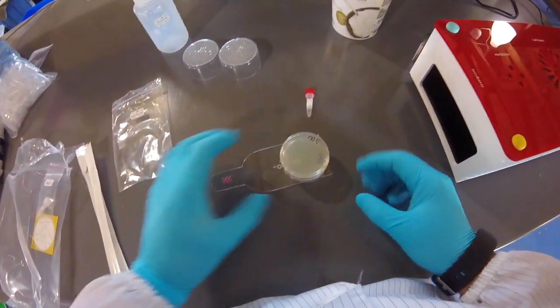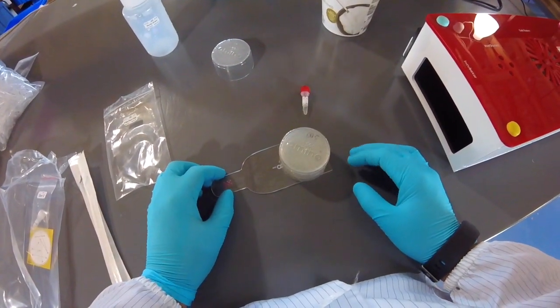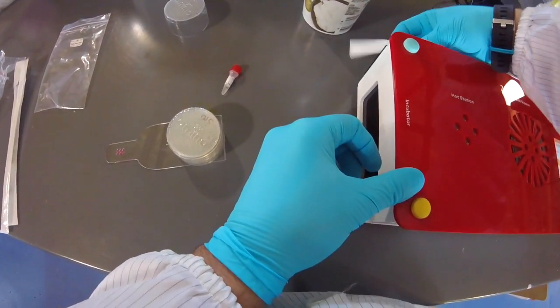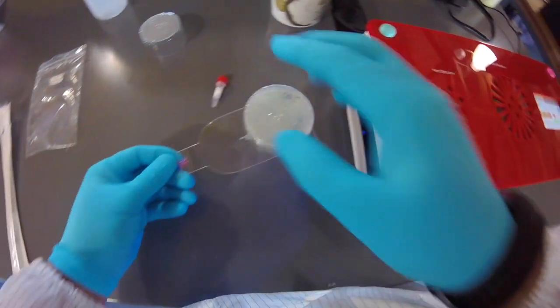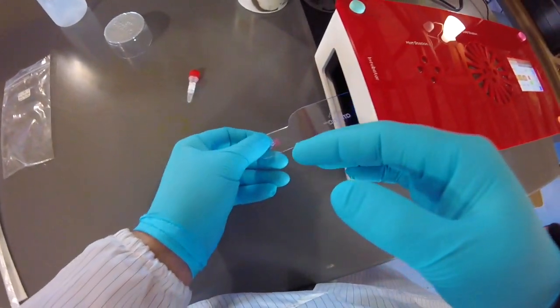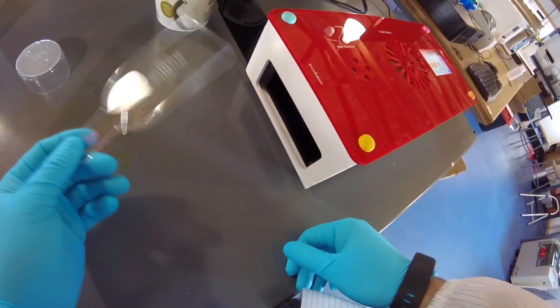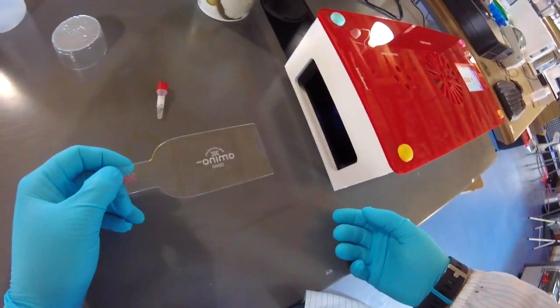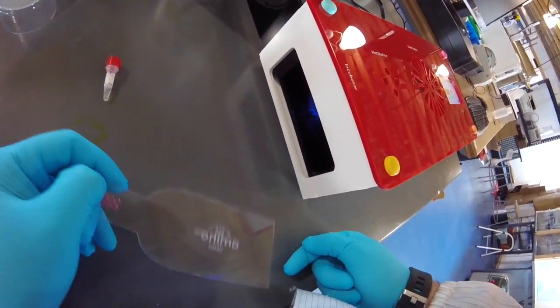Okay? All right, so you put on the little paddle. We're going to put the humidity chamber over. That's to help lock in some of the humidity. Just going to put that in, and you can fit up to 4 stacks, so 4 groups of students, or you can do 4 experiments at the same time if you want. Again, if you're not using 4, you can just put in however many you need, and in this case I just pushed it into the front here.